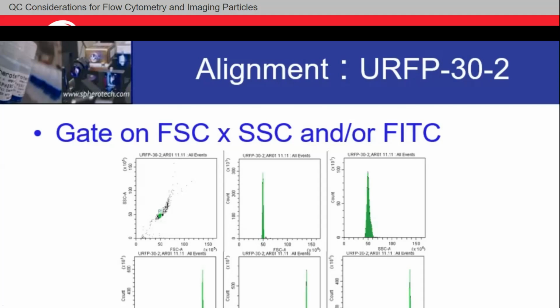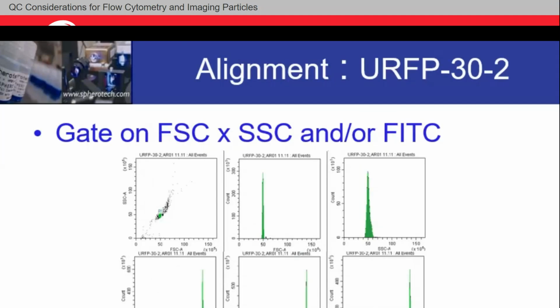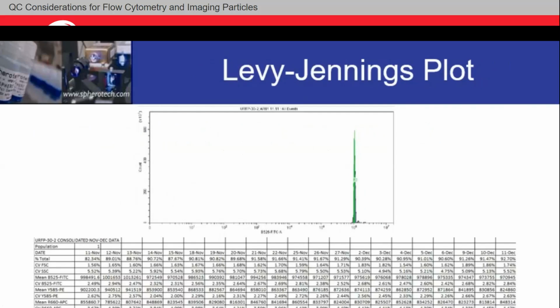But you can do just as robust research given these different kinds of parameters. And like I said, if you took that UW flow course, the University of Wisconsin-Madison annual flow course, you may even be able to build the anatomy of a flow cytometer and really see what it's like to get that pinhole and all these various very cool parameters lining up your microfluidics channel to your interrogation lasers. It's very fun.